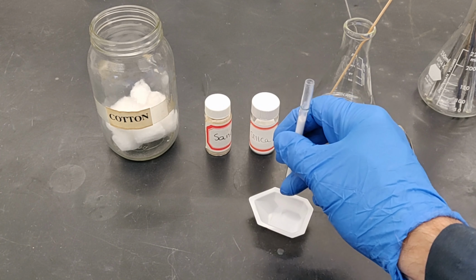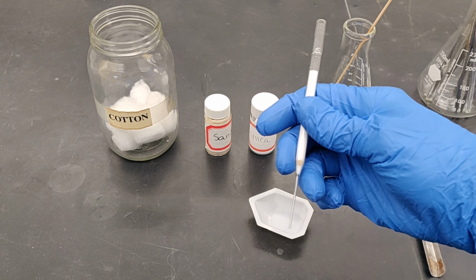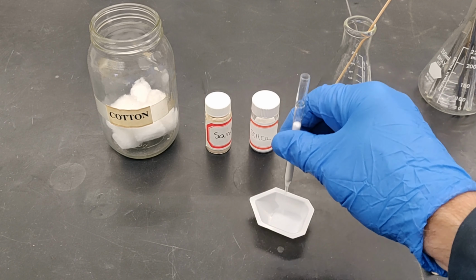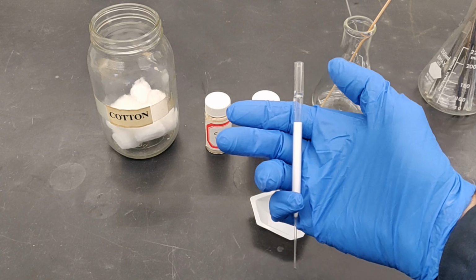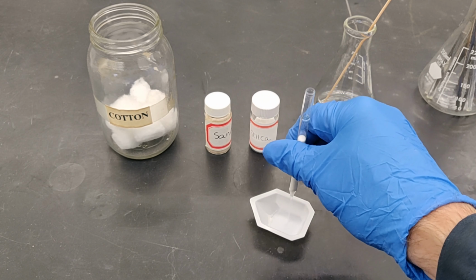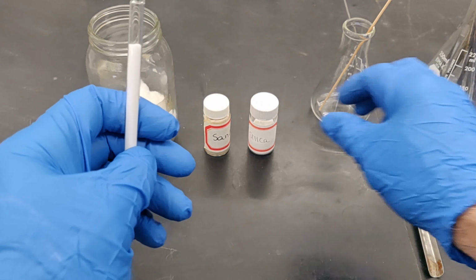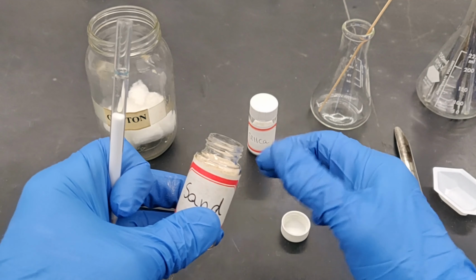Gently tap the pipette briefly on a soft surface to allow the silica to pack tightly. As you do this, you can see the height of the silica gel in the pipette decreasing. Then, cover the silica gel with a very small layer of sand.